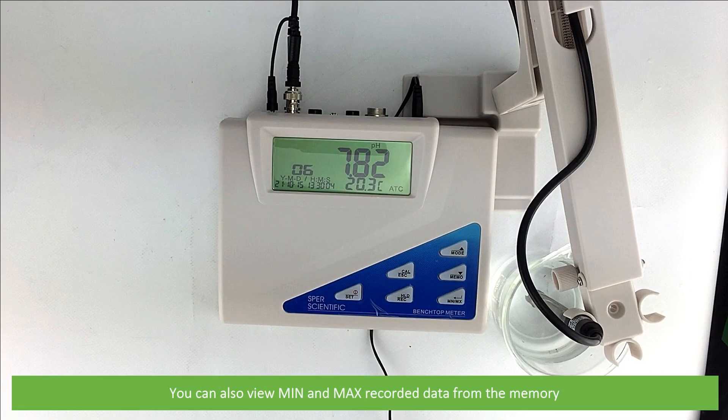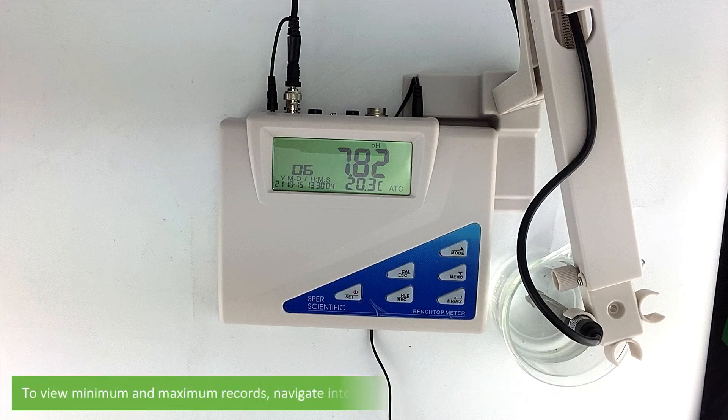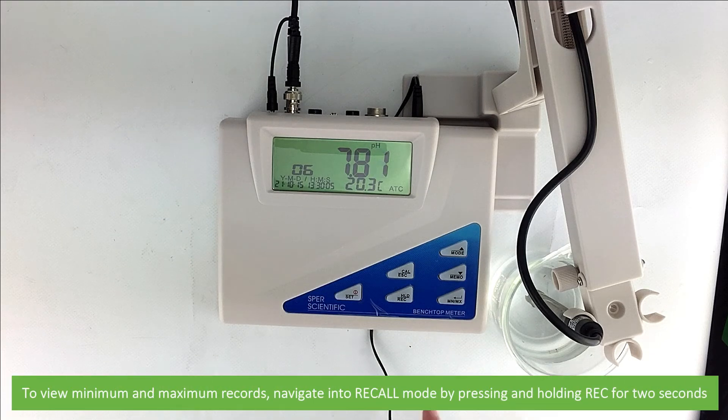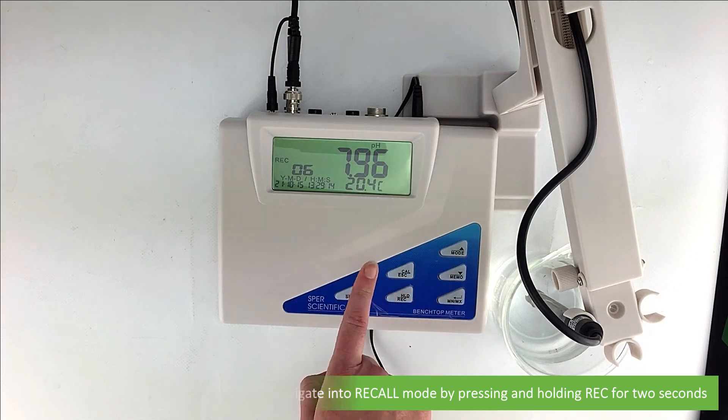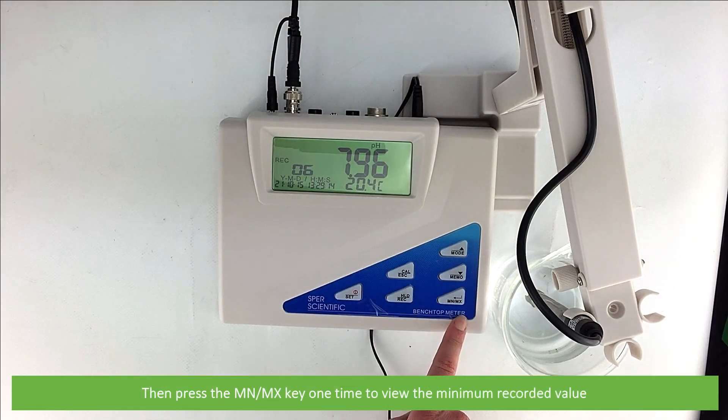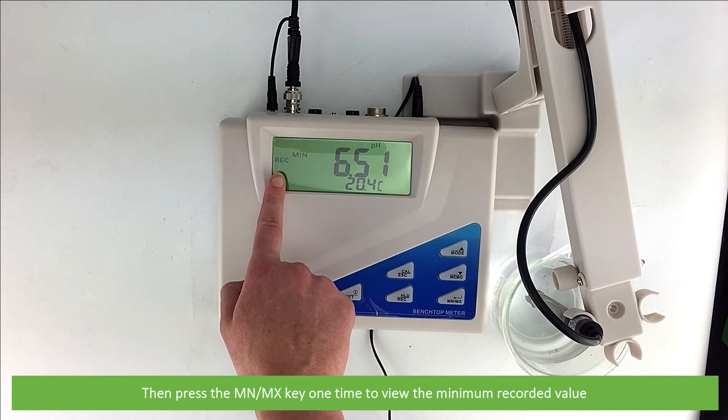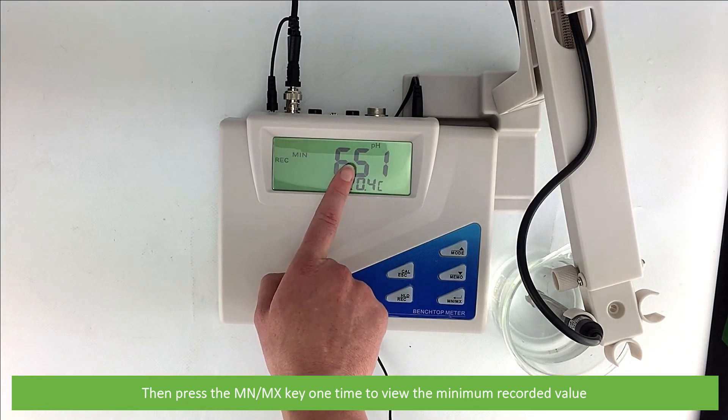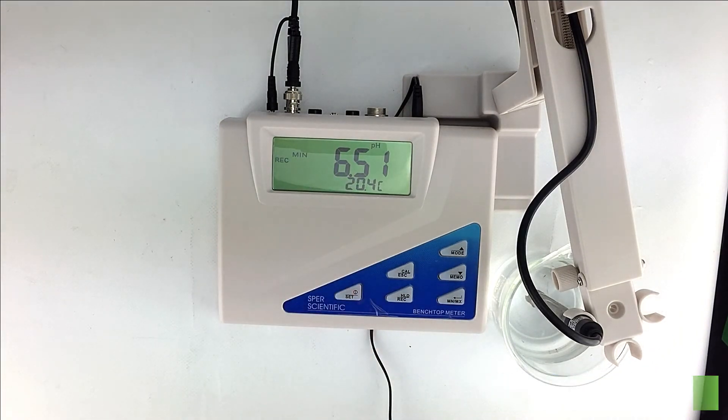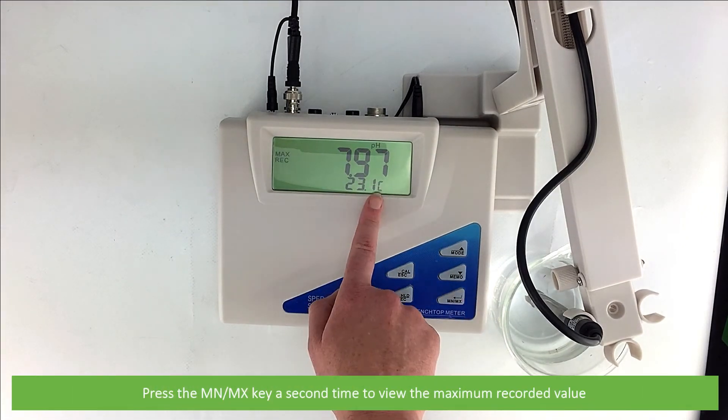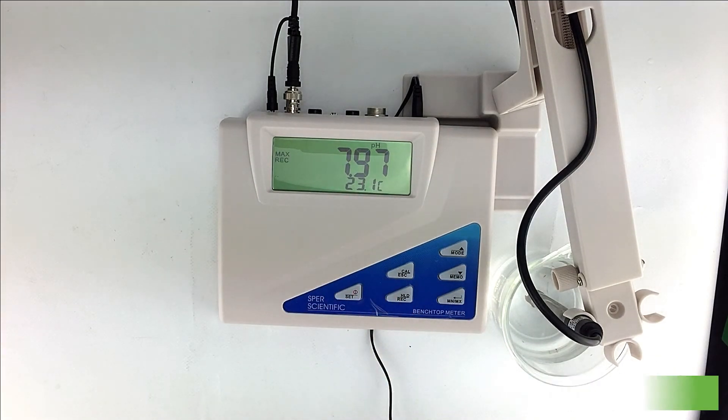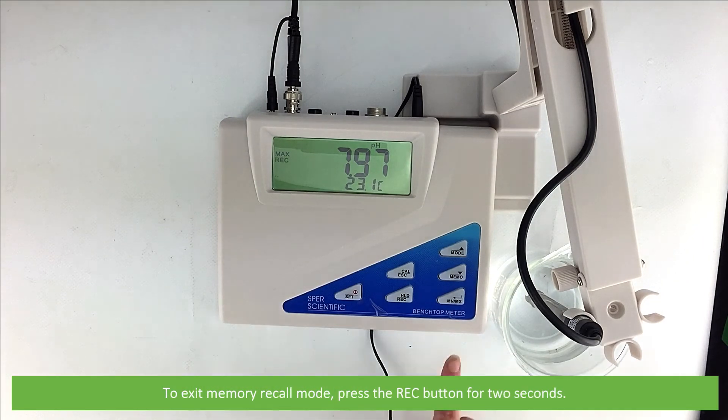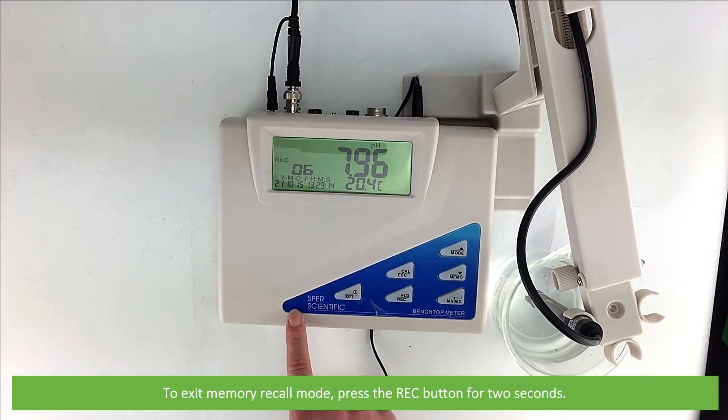You can also view minimum and maximum recorded data from the memory. To view minimum and maximum records, navigate to the recall mode again by pressing and holding REC for 2 seconds. Then, press the min-max key one time to view the minimum recorded value. Press the min-max button a second time to view the maximum recorded value. To exit memory recall mode, press the REC button again for 2 seconds.